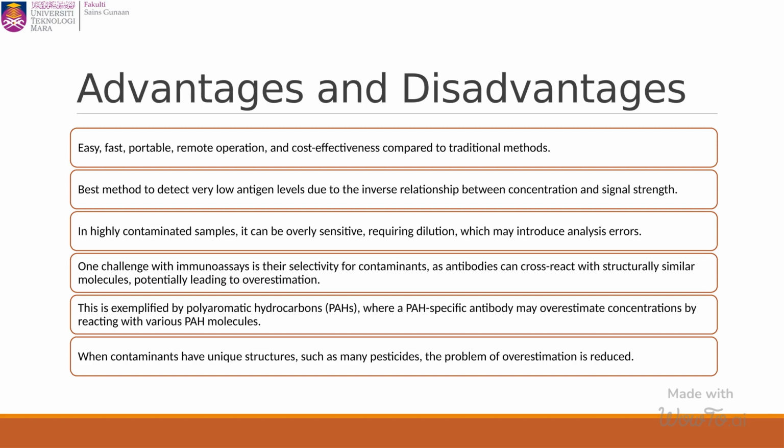The main issue with tests like this is they might react to things that look a bit like the substance we're looking for. For example, if we're checking for a specific kind of pollutant, the test might react to other similar pollutants, making it seem like there's more of the pollutant than there really is.